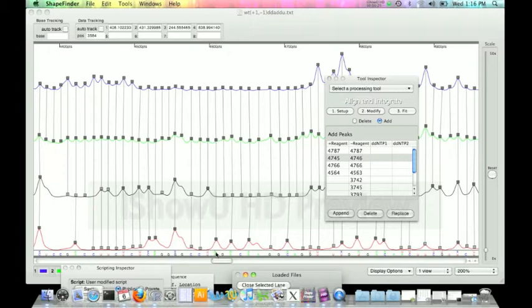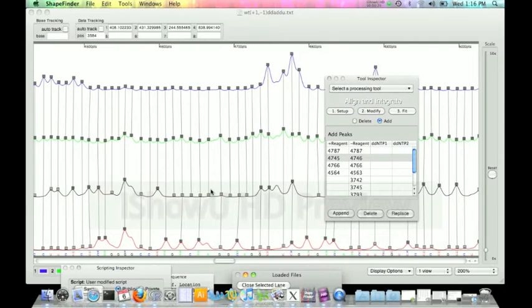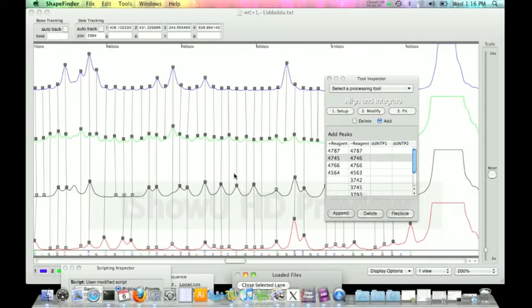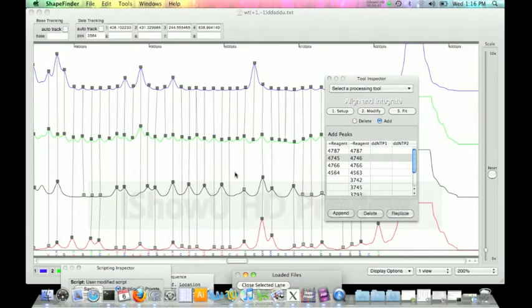So what you really want to do is make the top row match up with as much of the bottom row as possible. But the positioning of the bottom row has to be aligned with the ladders themselves. So this is where it gets a little tricky. Now what you're going to go through is you want to look and see where the sequence on the top row lines up with the sequence on the bottom row.